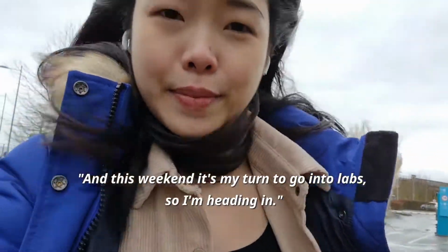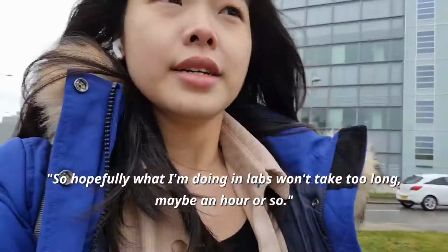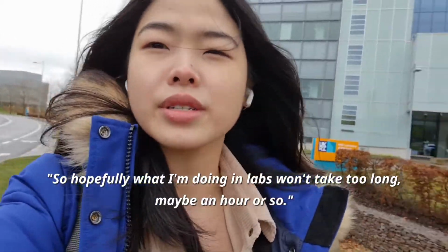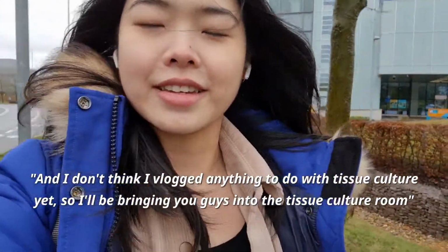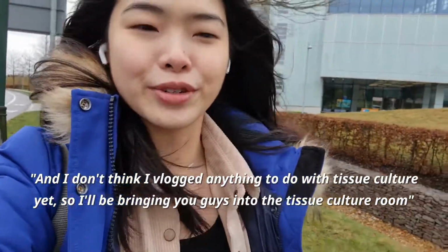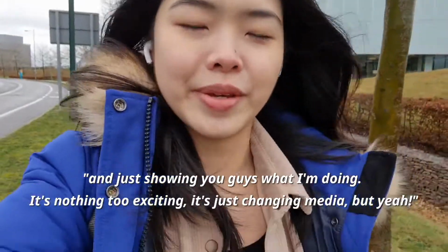And this weekend, it's my turn to go into labs, so I'm heading in. Hopefully what I'm doing in labs won't take too long, maybe an hour or so. I don't think I've vlogged anything to do with tissue culture yet, so I'll be bringing you guys into the tissue culture room and just showing you what I'm doing. It's nothing too exciting, it's just changing media.